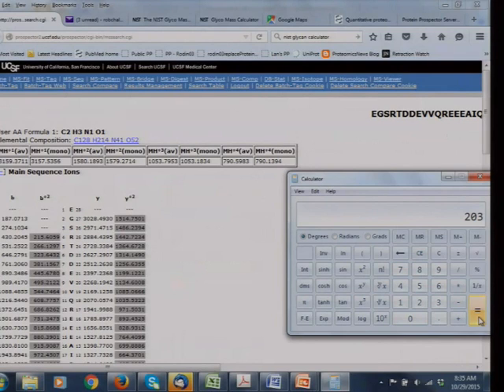So if you read the literature, you wouldn't expect to see an N-linked sugar with a single HexNAc attached. But when we do this glycopeptide analysis, we quite often find these, and other groups have commented on seeing these a lot. So why do other people never see these?